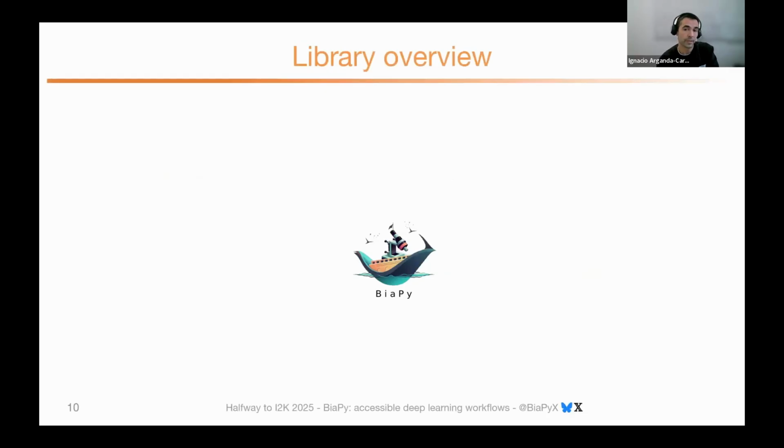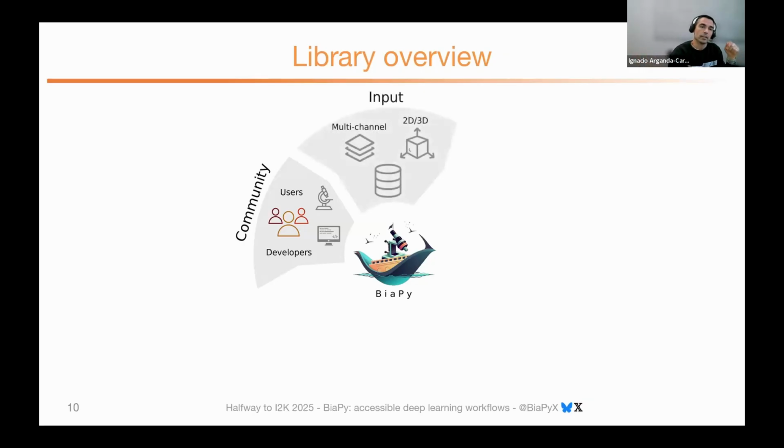With this platform, we try to address the full community, not only users from the very inexperienced to the most experienced users or developers, but we also wanted a library specialized, even if it uses deep learning, on the type of images and data sets commonly produced in bioimage analysis, which are usually multi-channel, have multiple dimensions, and can have a large diversity in size.